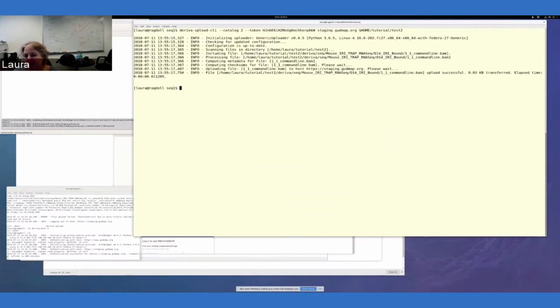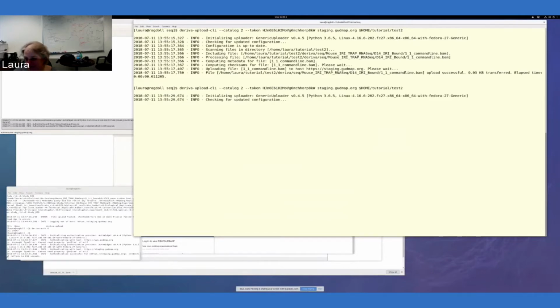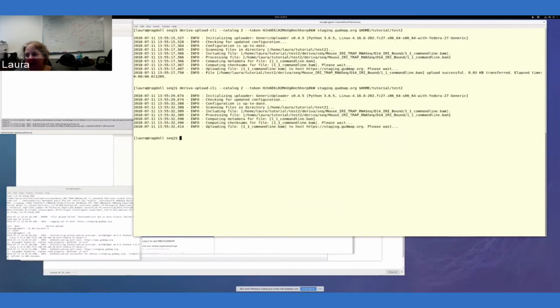If I do the same thing again immediately, you actually won't see the upload successful because it's not bothering to upload it, because it can see that the file exists and has the same contents.